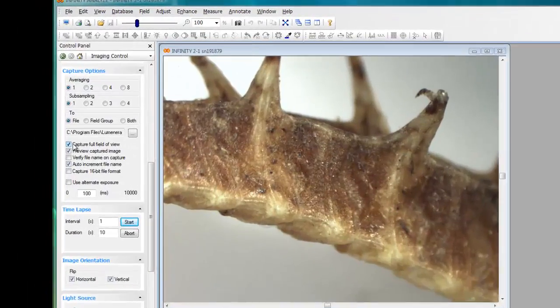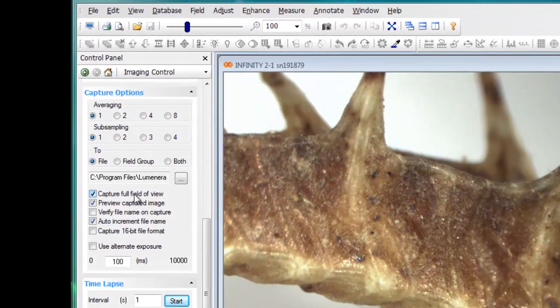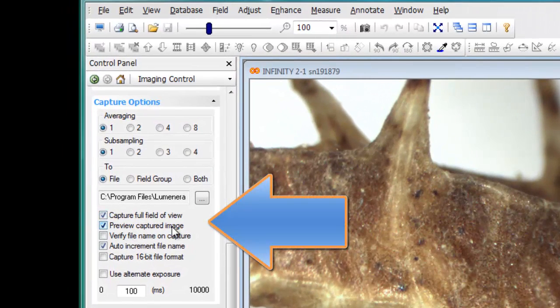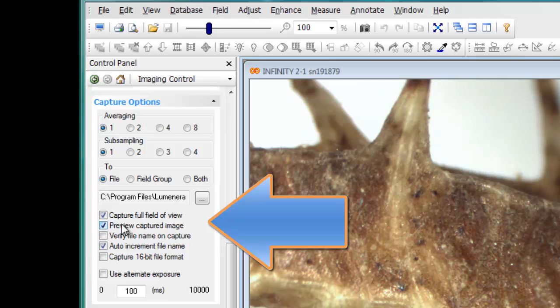When you first install Infinity Analyze, capture full field of view and preview captured image are two options that are selected by default.